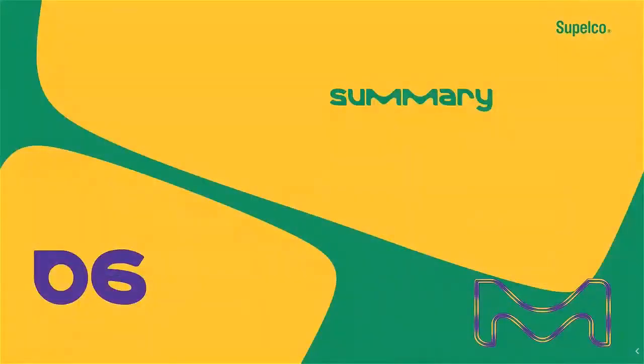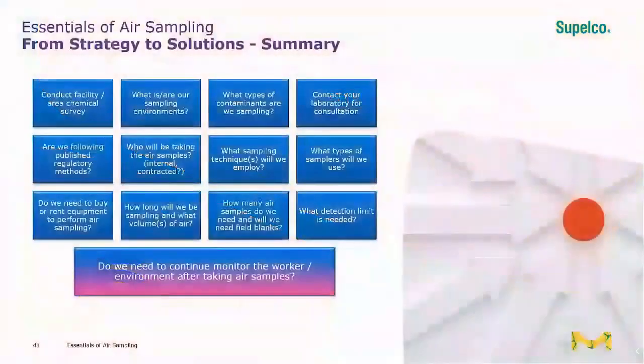And then in summary, this webinar started with the overview of the air sampling workflow and discussion of the different air sampling techniques to help you make decisions on selecting the right air sampling devices for your applications. It provided you with information on where to begin and what questions to ask, and points to consider when forming your air sampling strategy. The blue boxes are those same points revisited here.